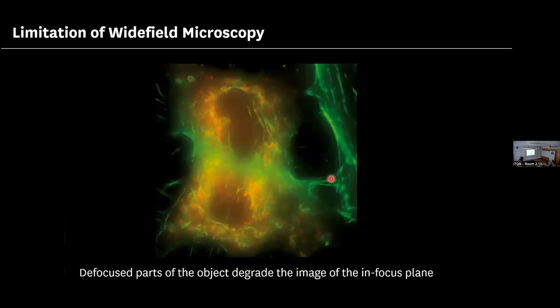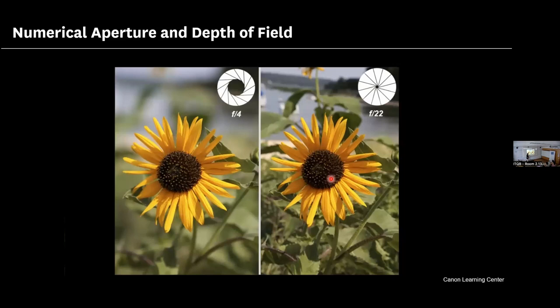On your mobile phones, you can use this as portrait mode. If you choose portrait mode on your camera, you see that the subject is very focused and everything around the background is blurred. This is actually a trick. It's a gimmick that you have on your phone. It's not really opening a diaphragm on the lens. It's just using software to recognize the object and blur the background.